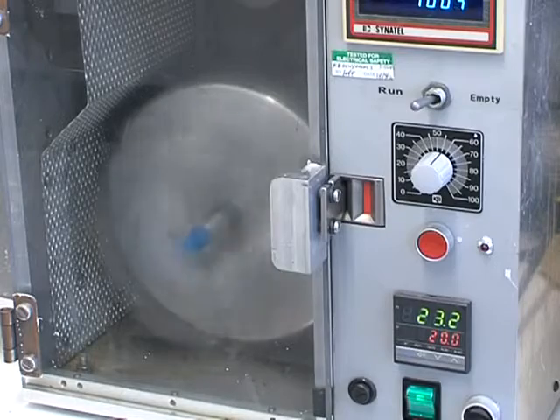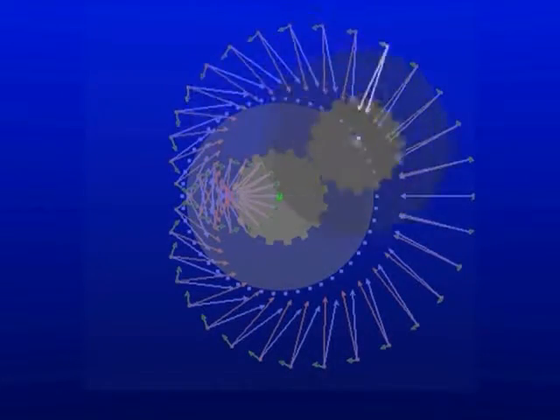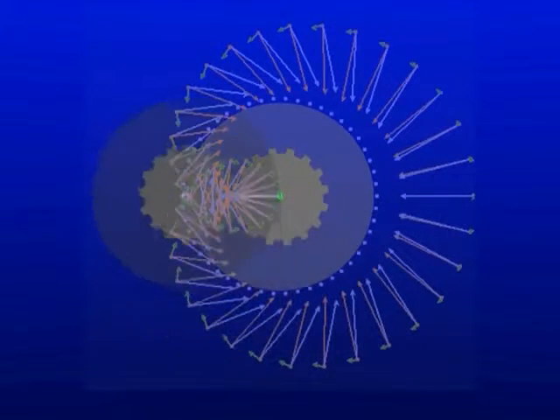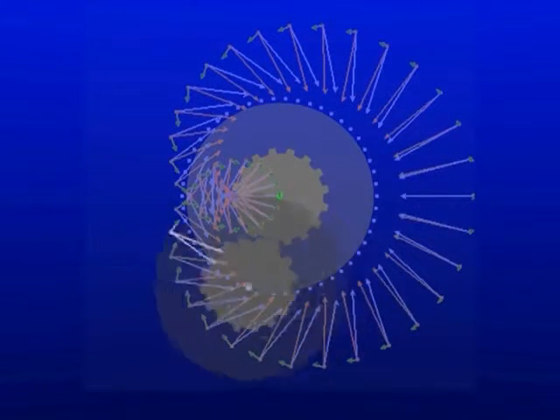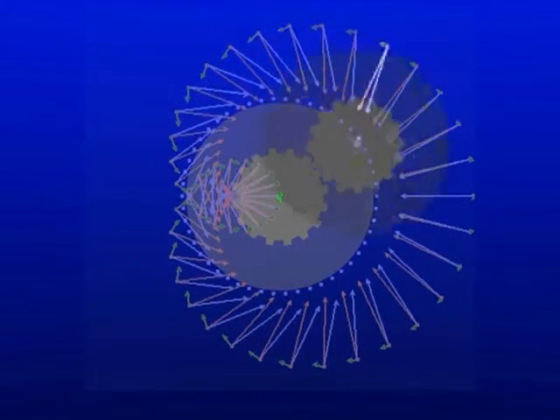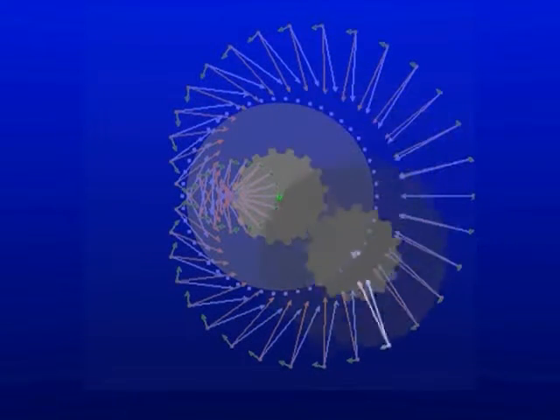In countercurrent chromatography centrifuges, tubing is wound in a coil onto a drum, called a bobbin, which is rotated in planetary motion. That is to say, the bobbin is revolving around the central axis of the Sun gear, while simultaneously rotating about its own axis at the same angular velocity.